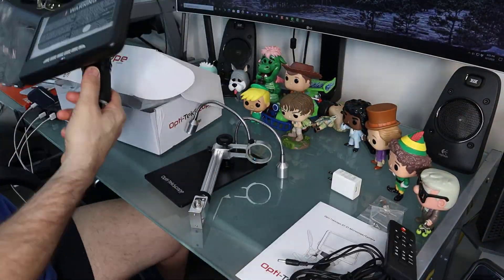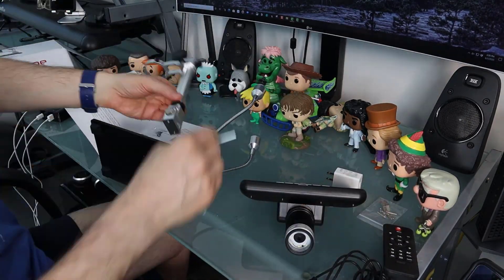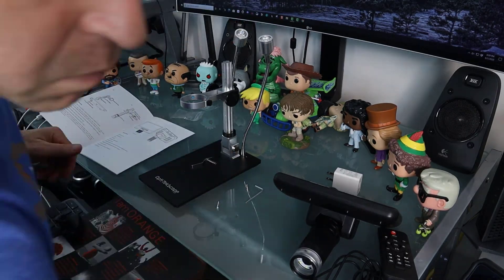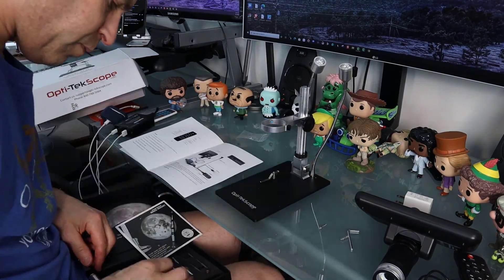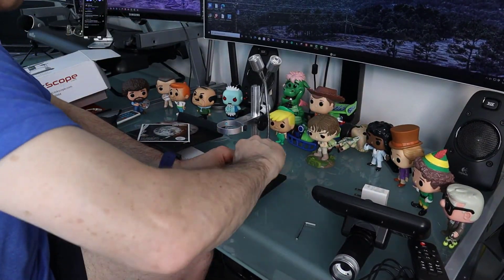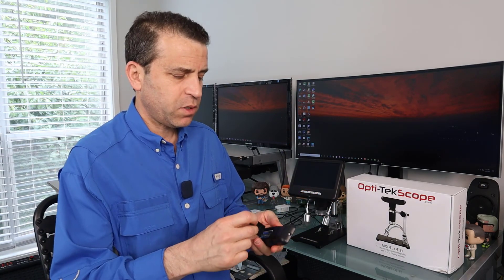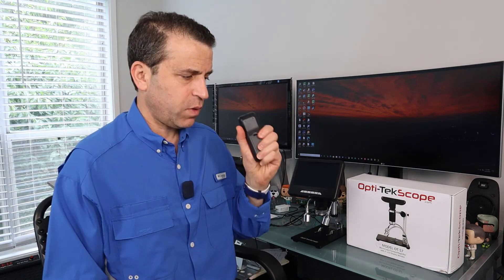Next, about installation — it's easy to do, as you can see here. Just four screws, basically. It does come with a hex wrench, but you will also need a Phillips screwdriver. So if you don't have one, you can borrow one or get one that's very inexpensive. With the remote control, it does not come with batteries. I use rechargeable AAA batteries — two AAA batteries — so that is something you'll need if you choose to use the remote control.